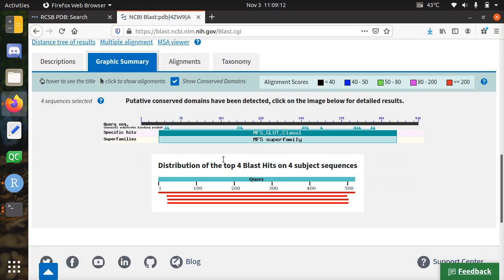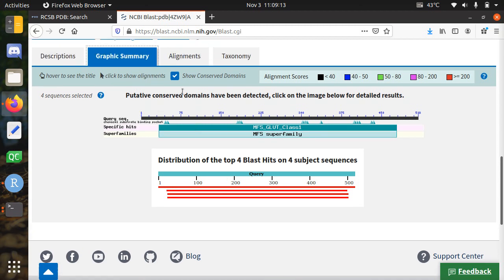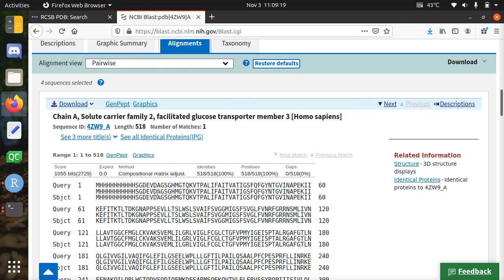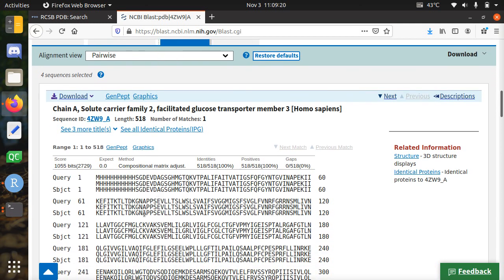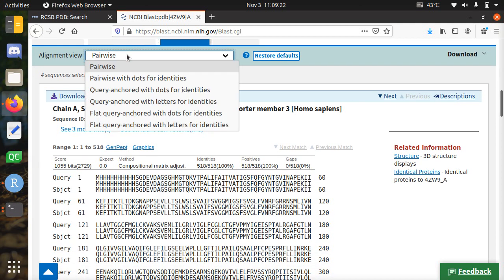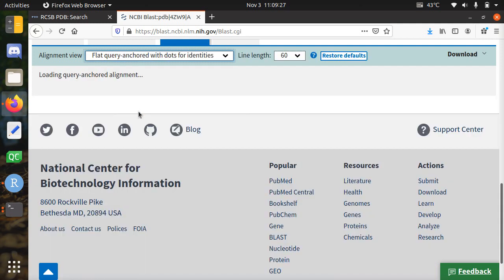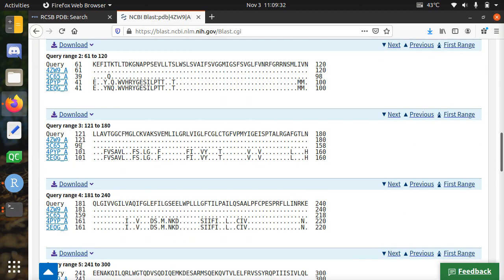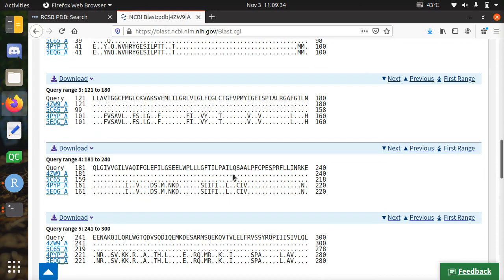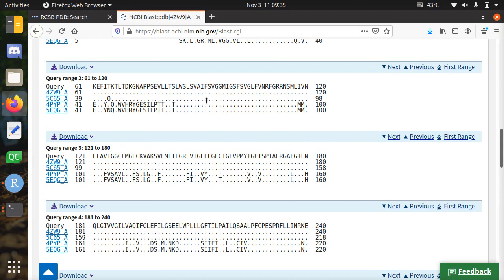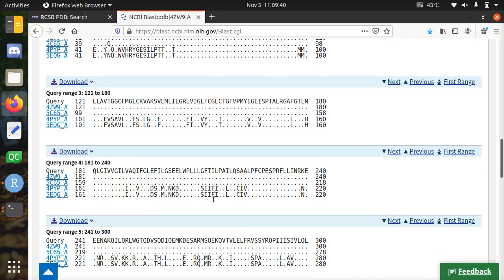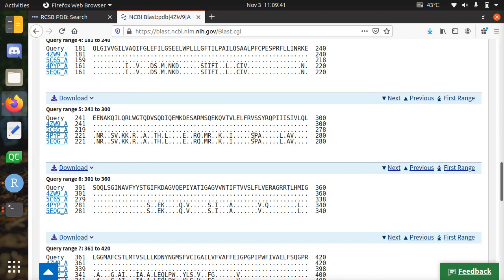I'm only interested in alignments. Here we can see the display. It shows up in a pairwise alignment, but I'd like to use this view. It doesn't matter for what we'll be downloading, but it will show you how these proteins are aligned, with the dots being the same as the number above. If you see a character here, you know it's a point mutation.